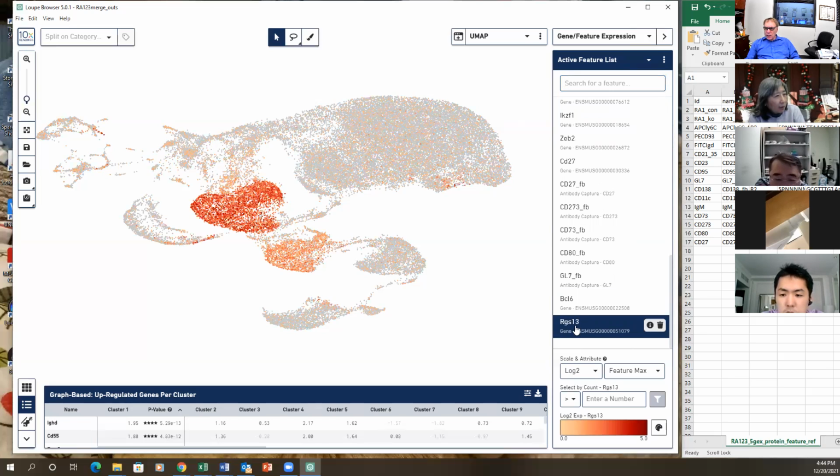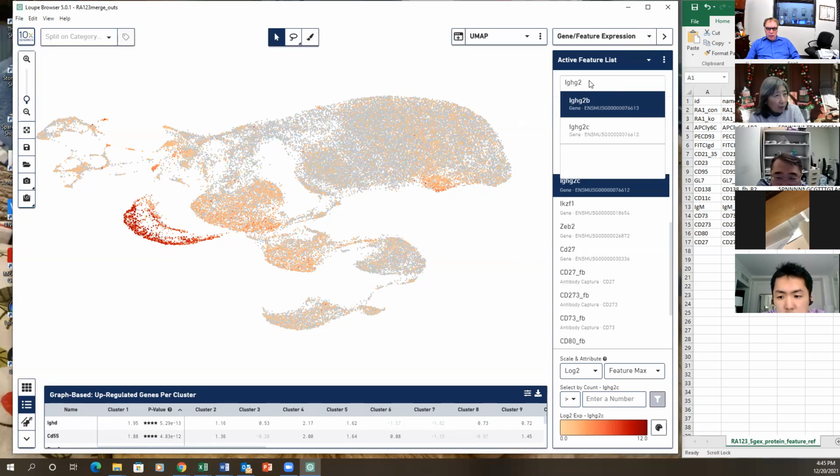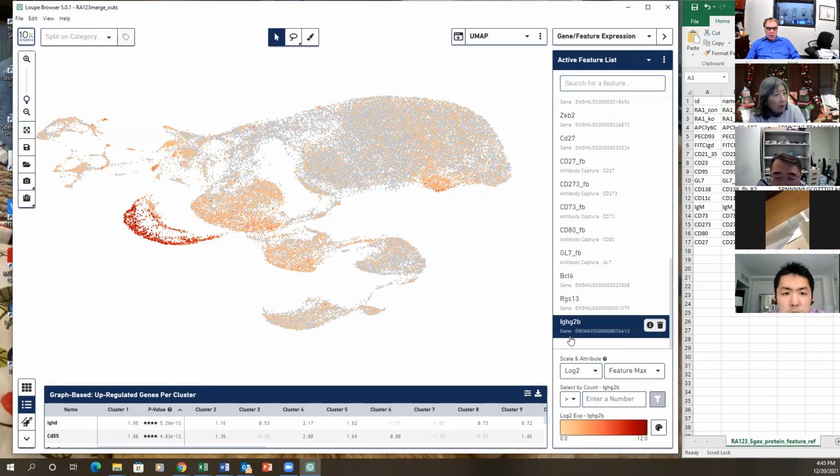Can you put in, here's a critical thing. How about IgG1? I just did IgG2C. You could see that this area, the germinal center, they're making, I think this is higher. Of course, cannot compare with the plasma. Oh, 2C, okay, that's 2C. Is 2C the one that's driven by interferon gamma, right? Right, that's right. And 2B is less so, we think. Still high here. So it is true, this area.